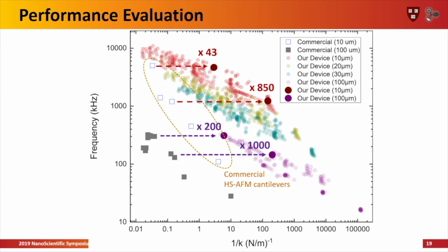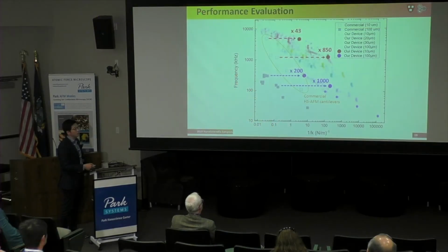In this case here, this particular design, with the frequency around 300 kilohertz, we also achieve really low spring constant. This particular design could be potentially useful for both dual mode of contact and non-contact scanning. So we selected these devices to go for fabrication.